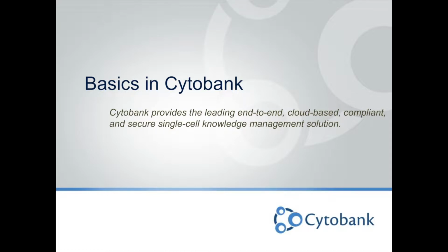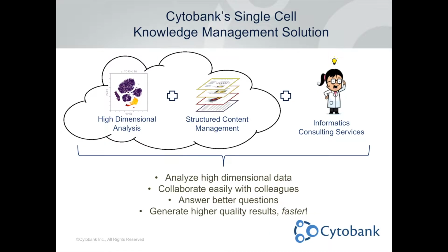Cytobank is a machine learning-assisted analysis platform for single-cell data that analyzes, securely archives, and enables collaboration in the cloud. In case you're unfamiliar with Cytobank, there are several portions of our company. We have our cloud-based software, where we have high-dimensional analysis tools. These are things like viSNE, SPADE, and Citrus.